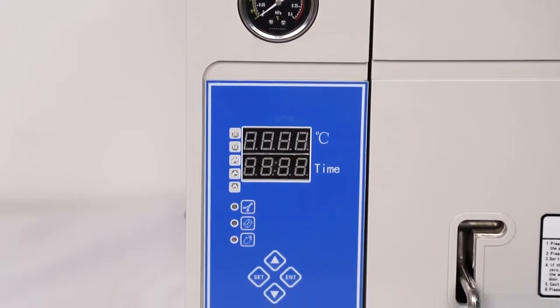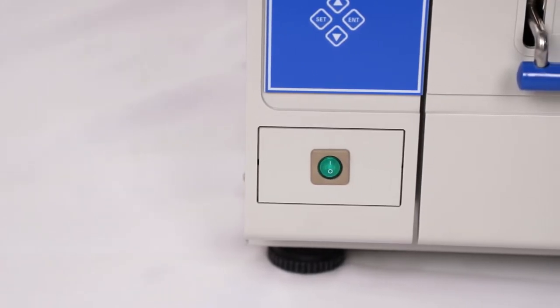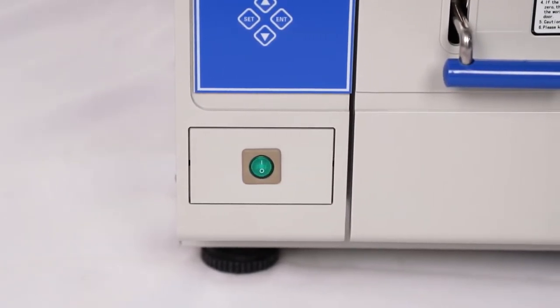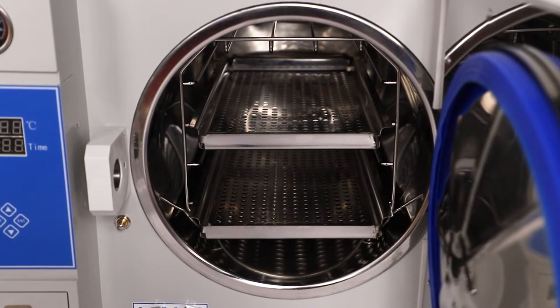Touch type key. Steam water inner circulation system with stainless steel sterilizing plates. The chamber of the sterilizer is made of stainless steel. Automatically shuts off with beep reminding after sterilization.